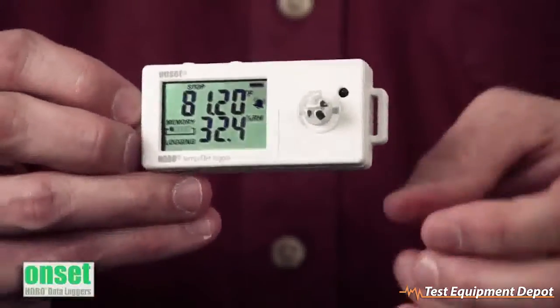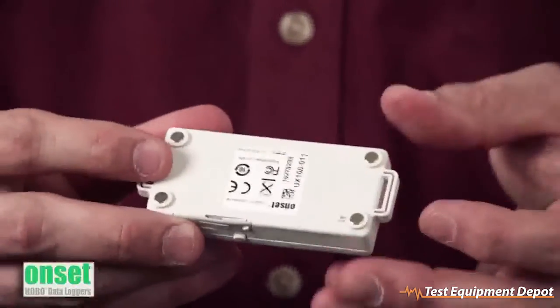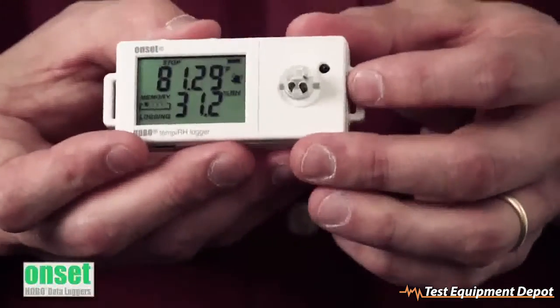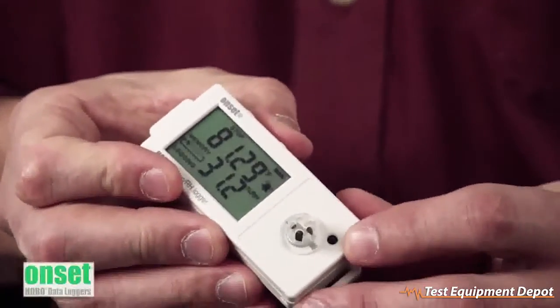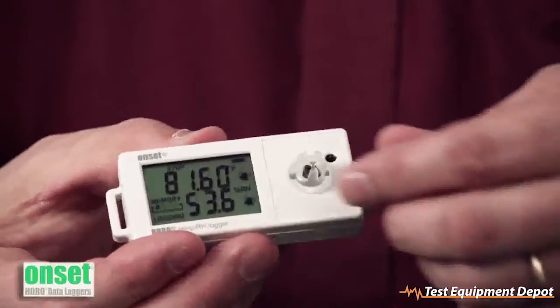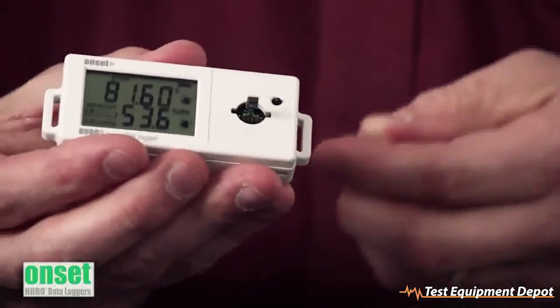We have a new case design. On the side, we have tabs which allow you to run zip ties through to strap this to something. On the back, we have four rare earth magnets so you can stick it to something metallic. On the front, to help increase the response time, we've put the thermistor right here sticking outside of the case, and we also have the relative humidity sensor mounted right on the front. This is also user-replaceable just by twisting the cap off and exposing the sensor and pulling it out.